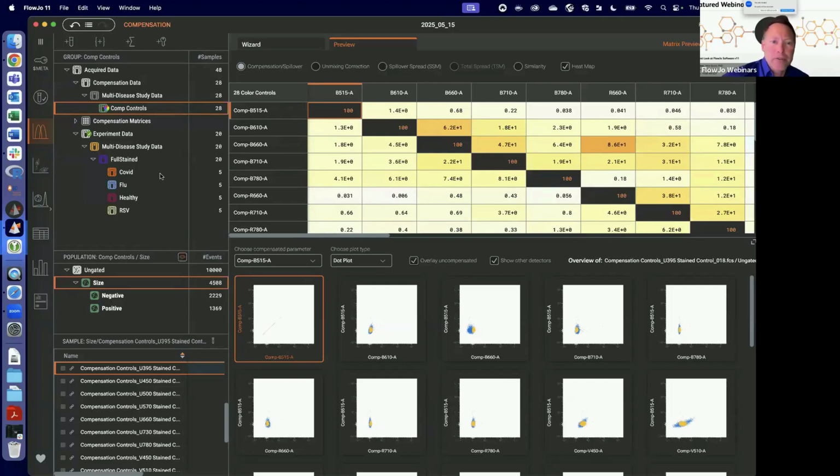If you were in traditional gate-based mode, you would pick, we named it a little differently, it is just called unassigned, I believe, instead of true zero. And then you can do specific autofluorescence, as many different controls as you bring in to demonstrate a spectrum of autofluorescence. Huh. Can you copy paste from a different workspace into a new workspace? No, I do not think you can. That's a good idea, Daniela. You can do that in FlowJo 10, but only for gates.